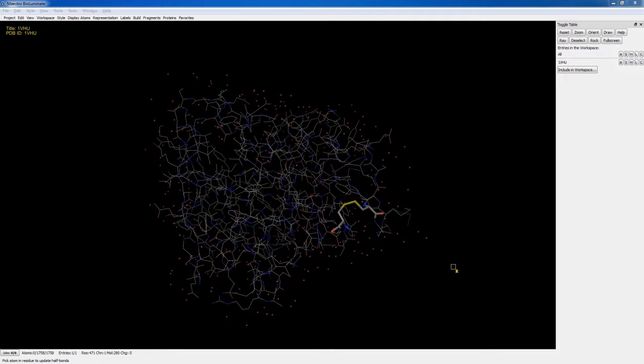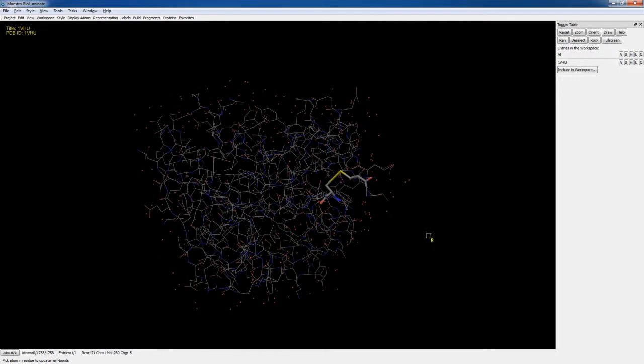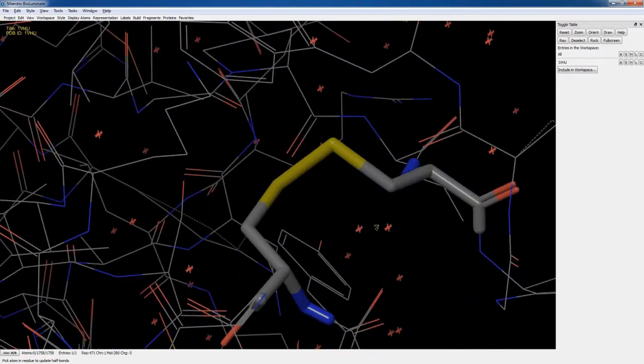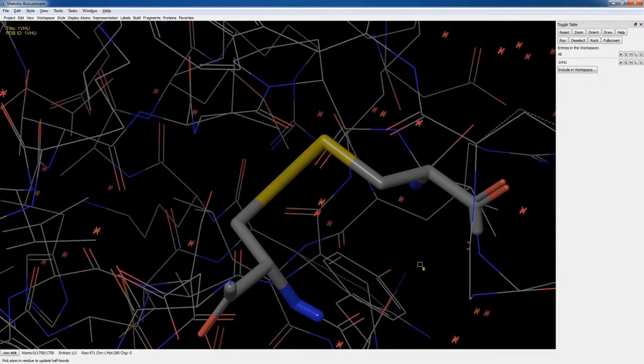In this video exercise, we'll demonstrate how to run a cysteine mutation calculation to locate and rank possible disulfide bonds using the protein 1VHU, which I have here on screen. Now, this protein already contains one disulfide bond, bridging residues cysteine 111 to cysteine 154.